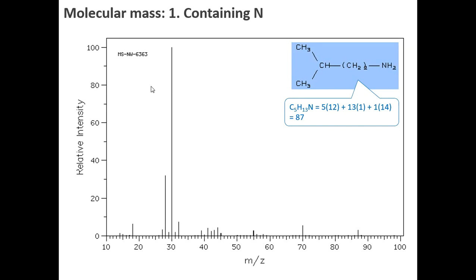So here's a molecule. This is its mass spectrum. To find the molecular ion peak, you look as high upfield as possible. That actually is a little bit of an impurity over there. And you'll find that this is the molecular ion peak. In the assessment task, that would have been pointed out as an impurity.